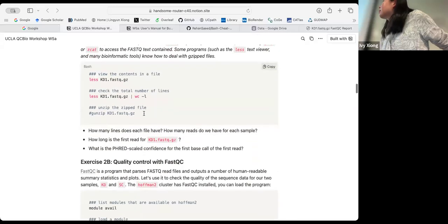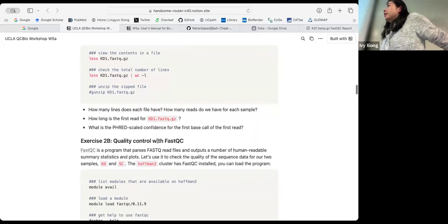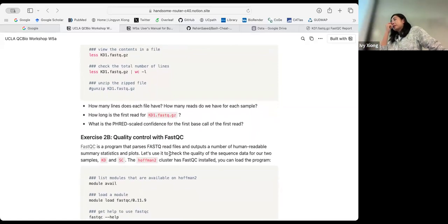Is there anything major from the FastQ file, if you're doing the check before you continue with the analysis, that sticks out and would say this isn't a good run? Yes, there are cases I've seen that just looked miserable. That means the sequencing didn't work. Most likely the sample quality was too low, or the cDNA library was not in good condition, where it got degraded somehow.